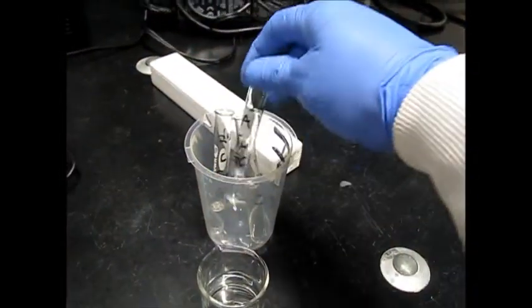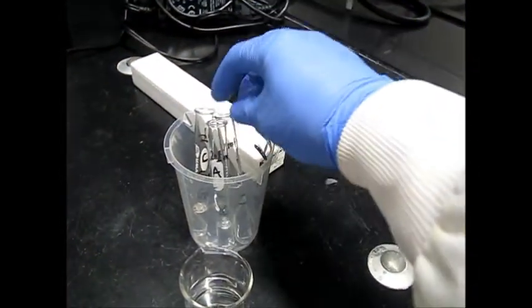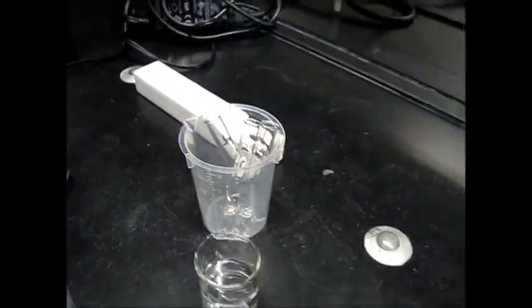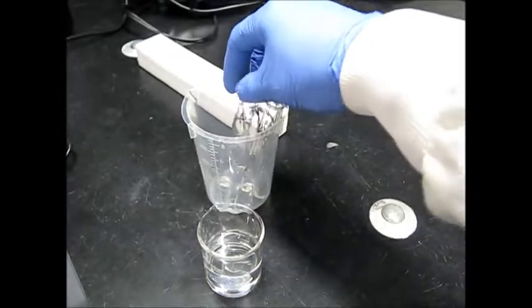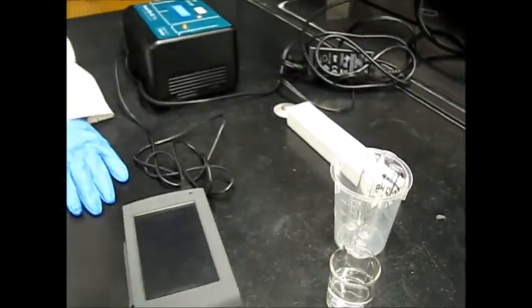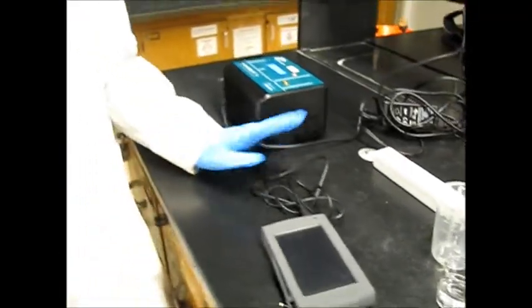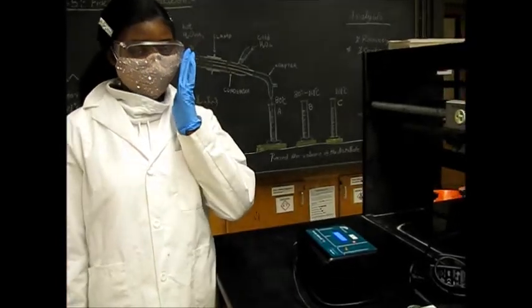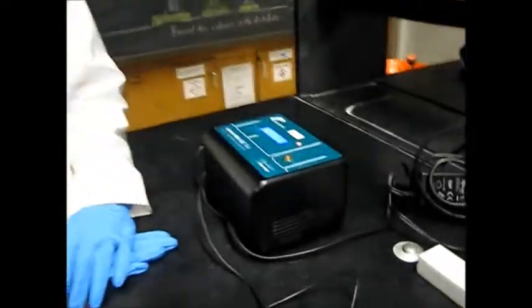So these are the three fractions which we have collected. Fraction A, fraction B, and fraction C. These are the three fractions which we are going to run in the GC. Okay, so we'll come back after 10-15 minutes once our GC will be ready.